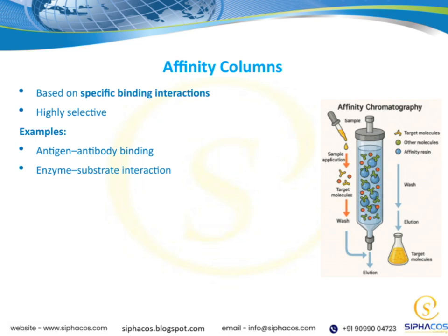Another example is enzyme-substrate interactions, where enzymes recognize and bind to their specific substrates to catalyze reactions. These highly selective interactions are fundamental to many biochemical techniques, especially in purification and analysis, because they ensure that only the molecules of interest are captured or separated. This specificity is what makes affinity columns so powerful in research and diagnostics, as they allow us to target and isolate specific biomolecules with great accuracy.